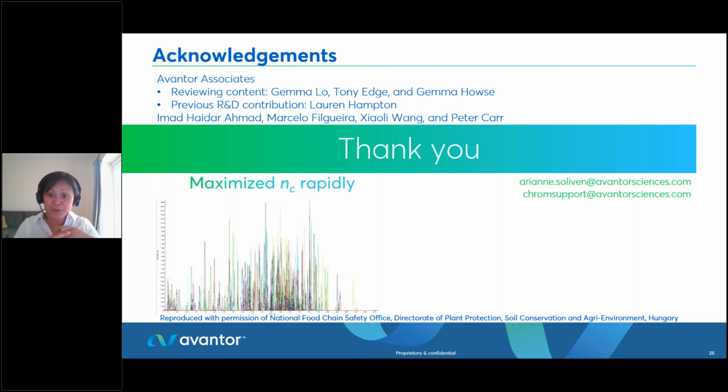So please use this to maximize your peak capacity for your LC strategy. And for sure, use other computational strategies at your will, because it's definitely going to improve and create a more confident and robust method, which you definitely want when you finalize your method development stage and enter into a validation stage. Thank you.